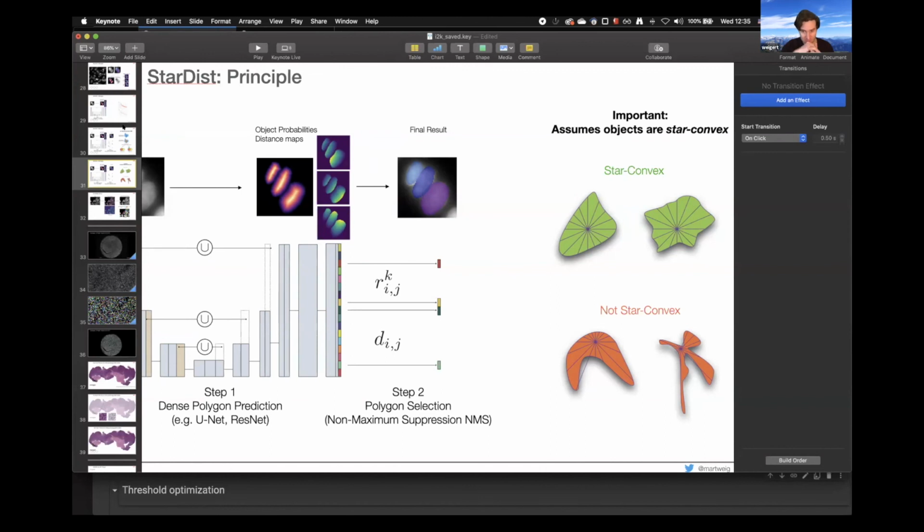And the hardest problem is to make it in such a way that it's robust, not only for a simple use case that I have, but to turn it into something that works for almost every problem that people have. So that is making it really robust. This is something you can try if you have a pipeline, and then you extend the library in some ways for your own use case, and then it would work. But we haven't come up with a way to make it work robustly across different data sets, because there are a lot of thresholds.